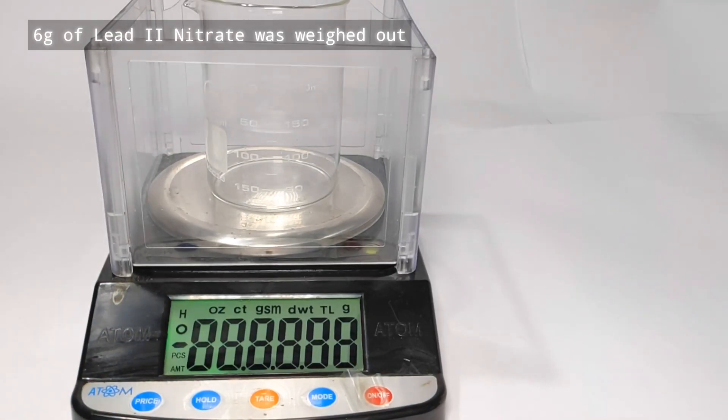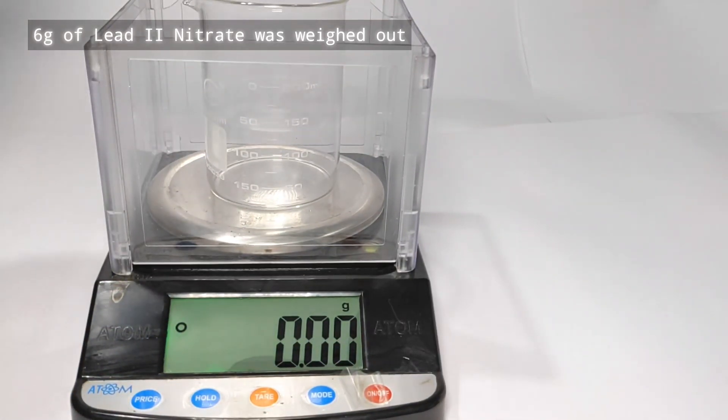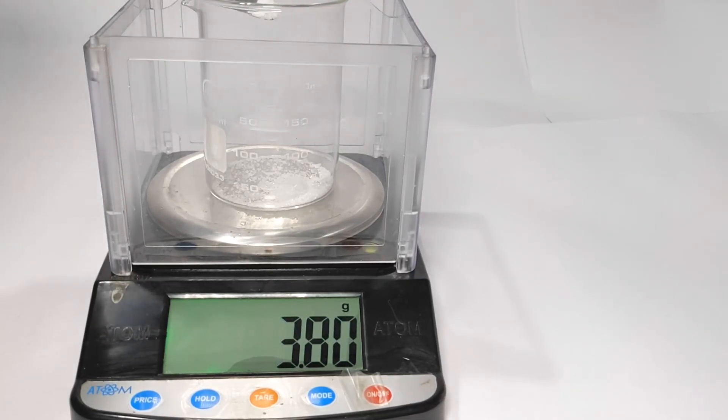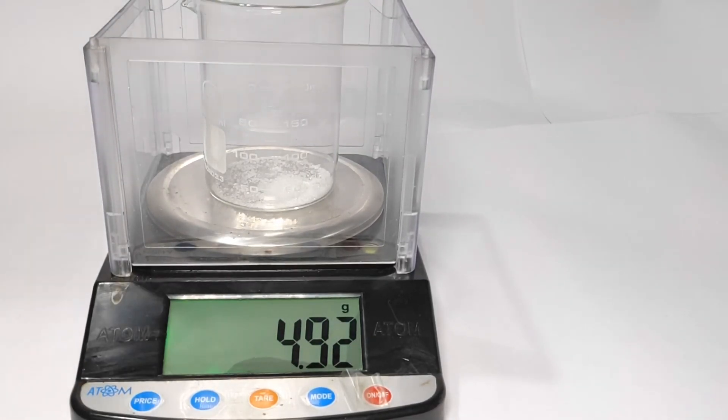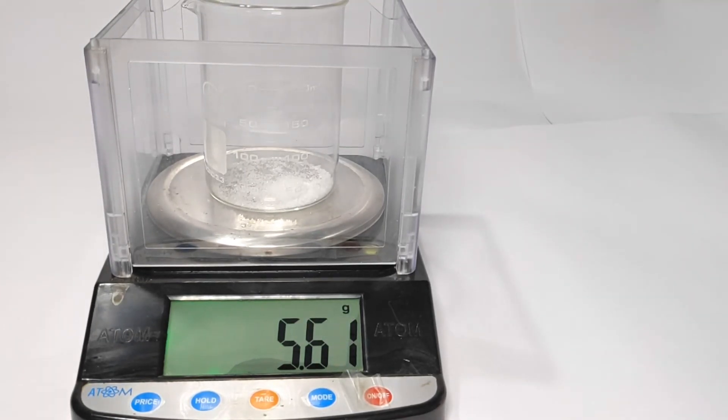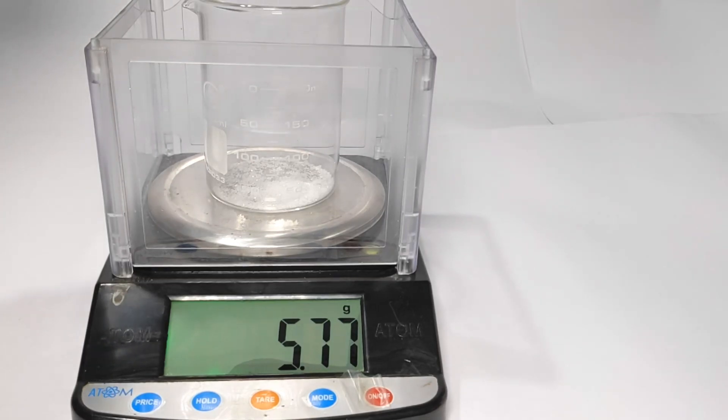Start by weighing out the reactants. 6 g of lead(II) nitrate was weighed out in a 250 ml beaker. Lead(II) nitrate is a colorless, crystalline, very toxic salt. It is also water soluble and could cause acute lead poisoning.